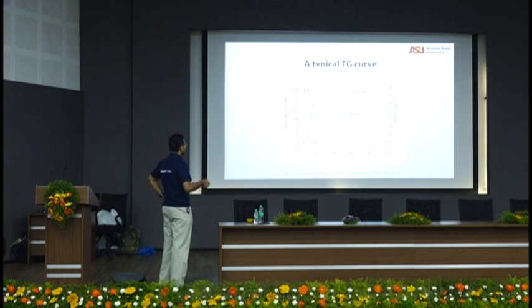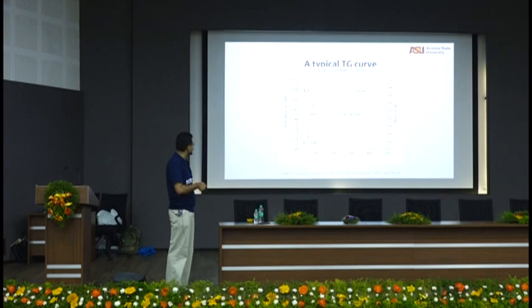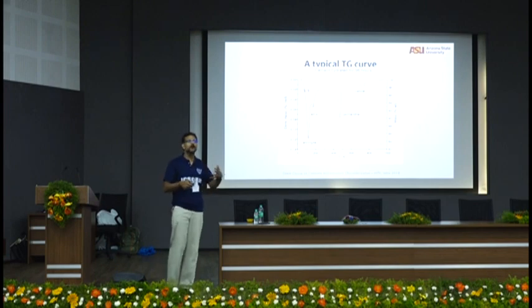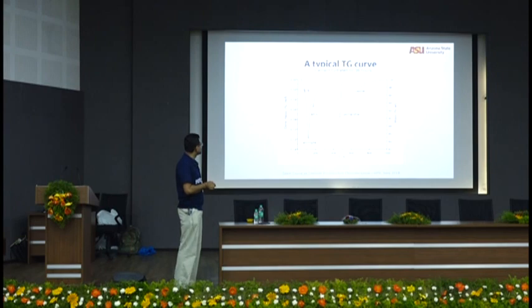Portlandite, calcium hydroxide, is never a problem. If you see anything between about 450 and 500 degrees Celsius, that is calcium hydroxide in the cement system. Look at how lovely that derivative peak is, and how lovely that mass drop is. That is calcium hydroxide for sure. Calcium carbonate, depending on the polymorph, vaterite, aragonite, may show slight differences, but anywhere between 700 and 850, you can be sure that's calcium carbonate, calcite.